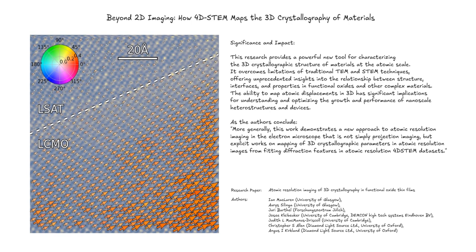This research demonstrates how understanding the intricacies of crystallography and strain can be harnessed to create materials with enhanced functionalities. The combination of advanced imaging techniques like 4D-STEM with a deep understanding of materials science principles is truly powerful. As these techniques become more refined and accessible, we can expect even more groundbreaking discoveries in the world of material science. This is just the beginning.